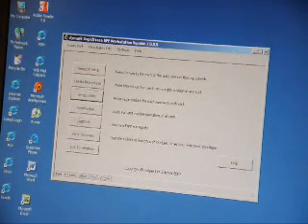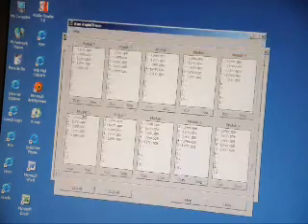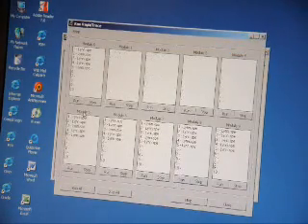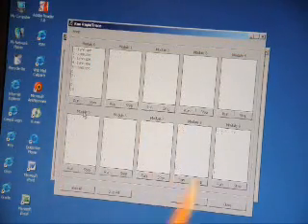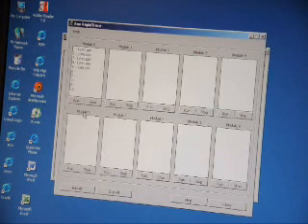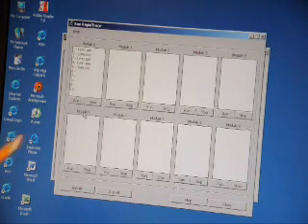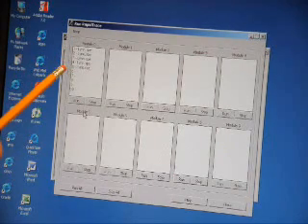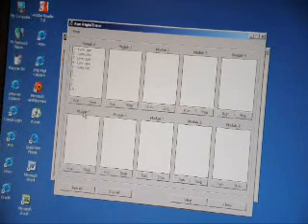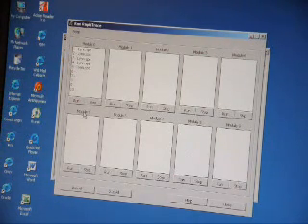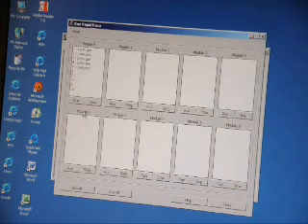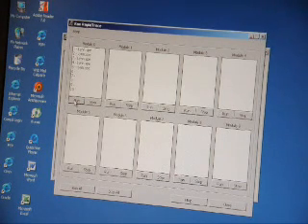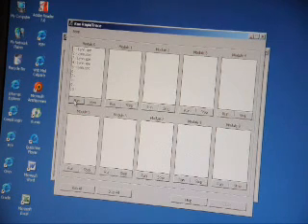Now I'm going to go to what's called Run Monitor. And what's going to happen is this system is going to go out and scan. And what it's found is I only have one module installed, module zero, and it knows that it's set up to run the method Lynn for samples one through five. To get this started, I'm going to click the Run button. And that's going to start this method running.